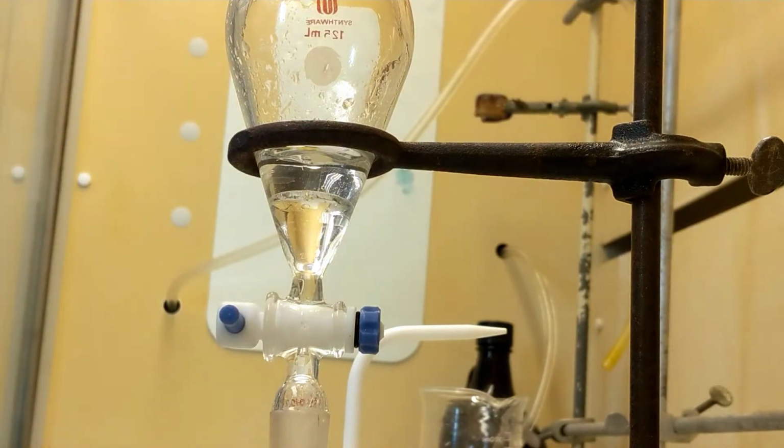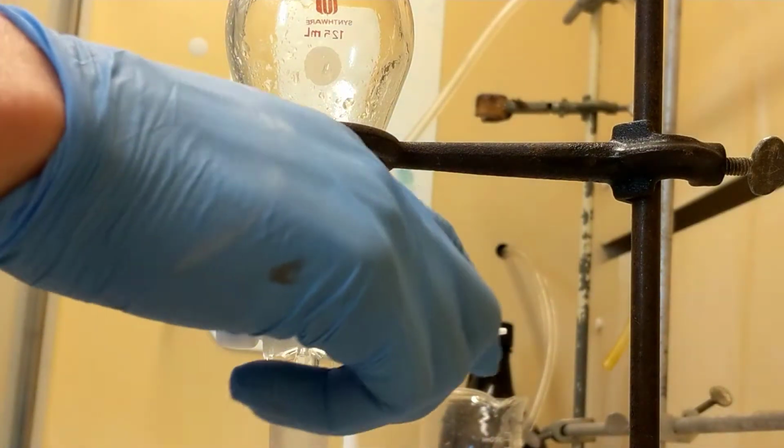Alright, it's okay if I get a little bit of the aqueous because I'm going to end up drying this liquid in a second. So I'd rather have a little bit of the aqueous in my organic than have any organic left here in this separatory funnel. So I'm just going to do that now.